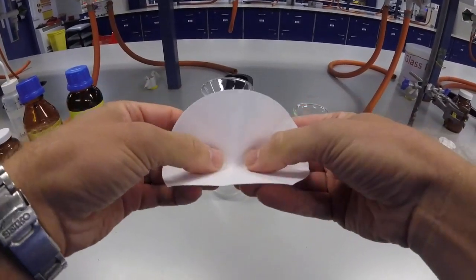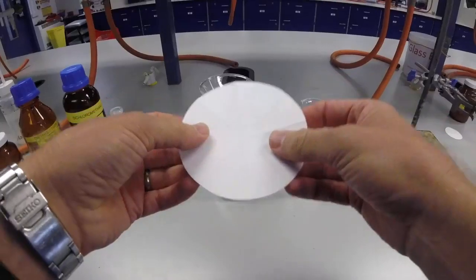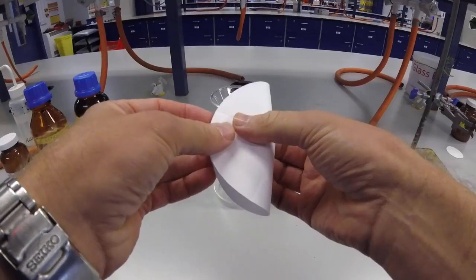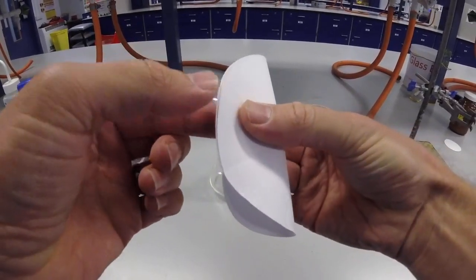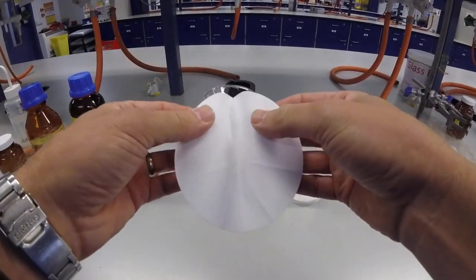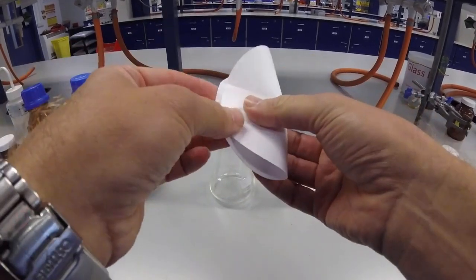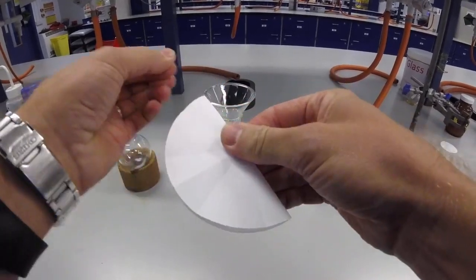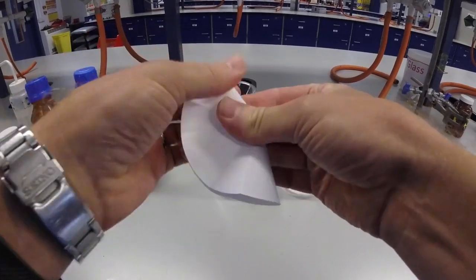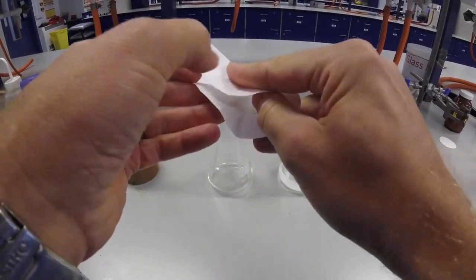So now you should have 8 folds all in the same way. And in order to get the fluted part, you're now going to turn it over and you take 2 parts, match up the folds over here, and then press and fold. And so now we've bisected those 2 folds. And then you're going to repeat that all the way around with each one of those 8 previous folds. You're going to bisect them, and so now you have 16 folds. And then the last one here.